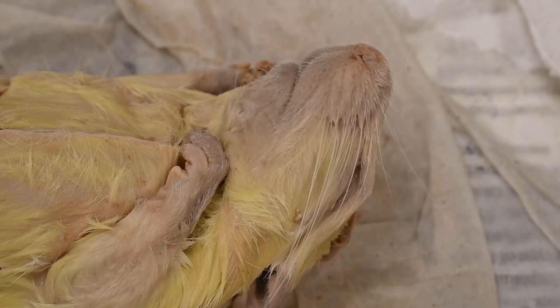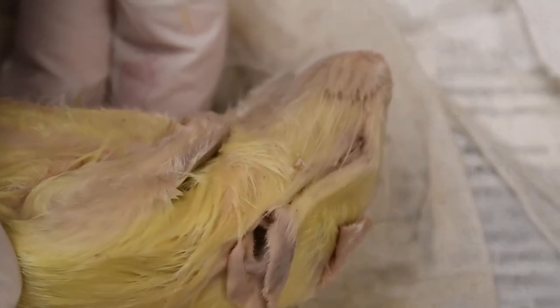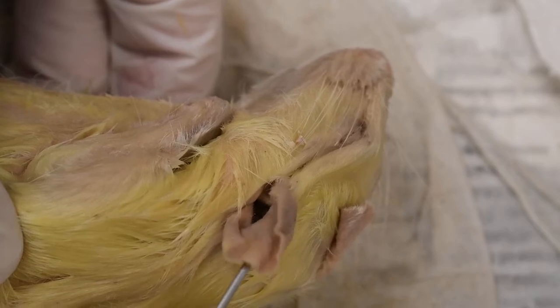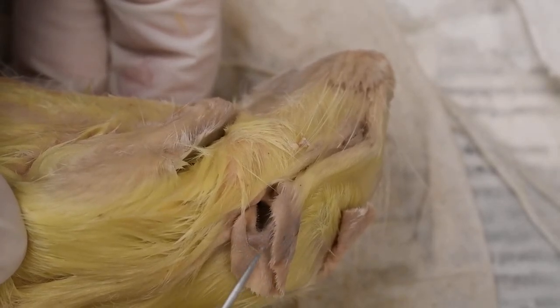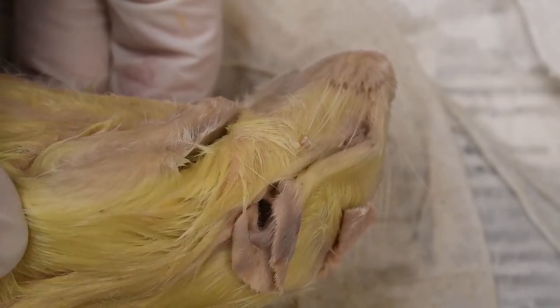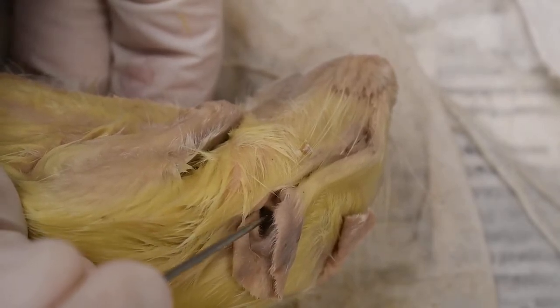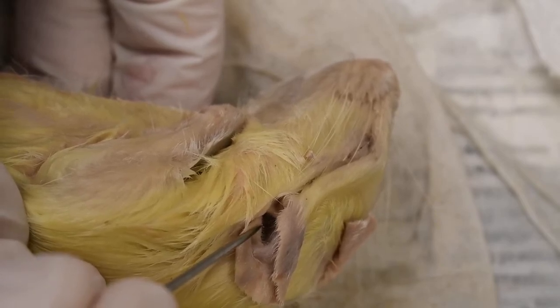In this video, I'm going to review the anatomy of a rat. Okay, so we'll start out by taking a look at the head. As you'll see in the PowerPoints, this structure here, which you probably call an ear, is actually called a pinna. The ear is deep inside the head. This opening here is called the external auditory meatus, and it leads down to a tympanum.